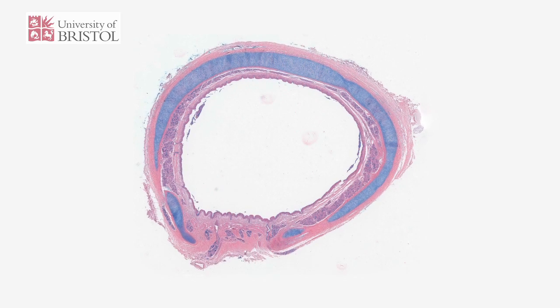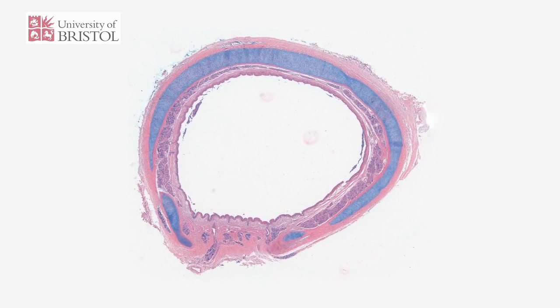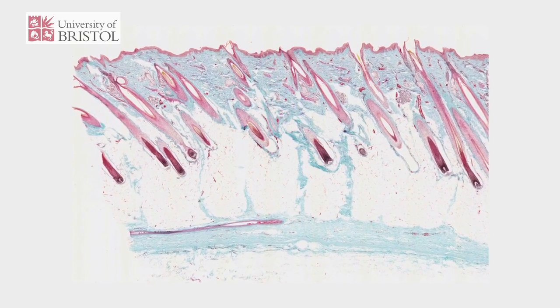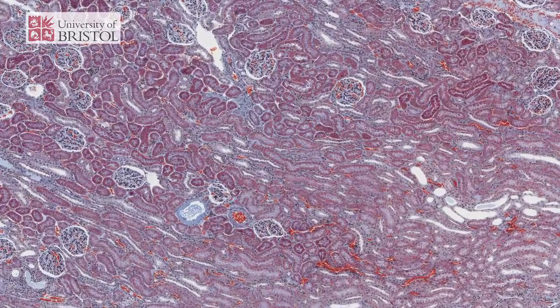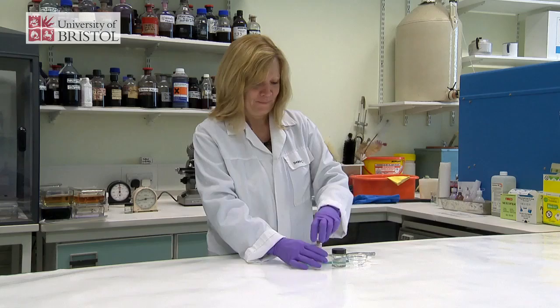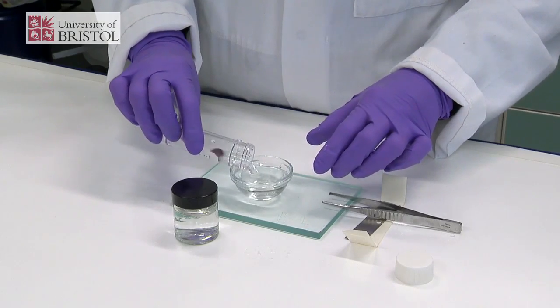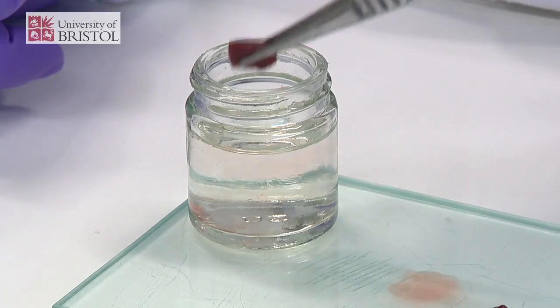We do histology for many reasons, but for teaching purposes, we teach histology to enable students to recognise the normal structure of tissues so that they can have a basis for recognising when things go wrong in pathologies. And also, it enables them to relate the structure of tissues and cells to their specific function.